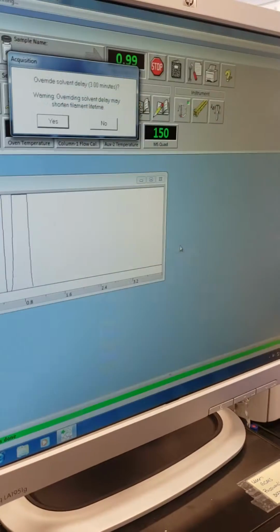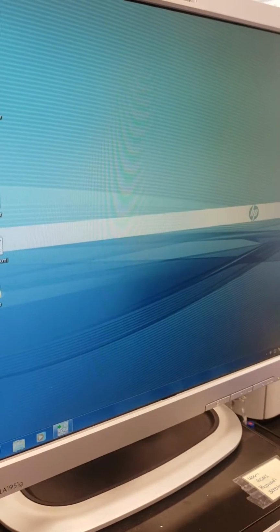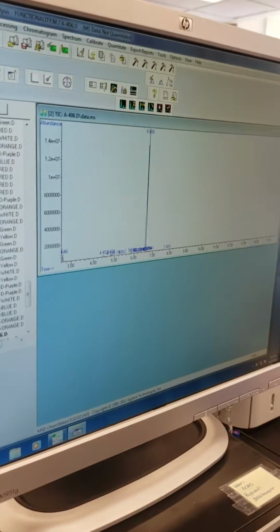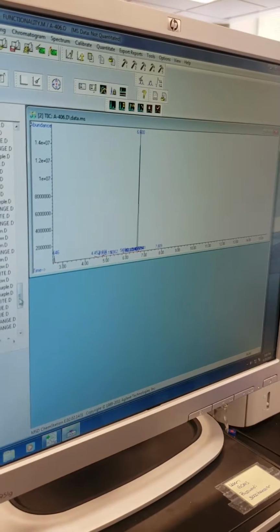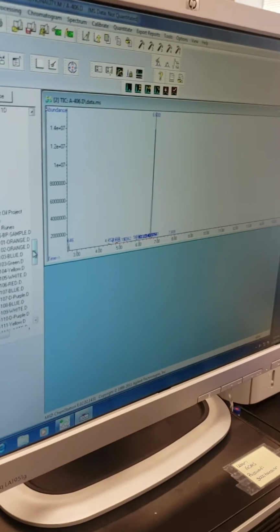Is there other files? Well, it's like an NMR. It's accumulating, and if they don't close it, at the end you have like 1,000. I think that is what happened here.